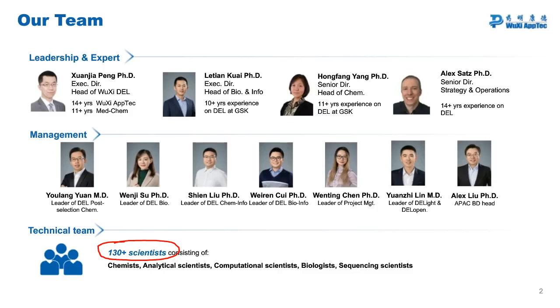Every target protein could have multiple compound binding sites. Does DEL just screen for the compounds that have the highest binding affinity? Now, that's probably a fair assumption. If you had more than one binding pocket, you can certainly end up finding binders, even if they're less potent, which are binding to the other binding pocket.